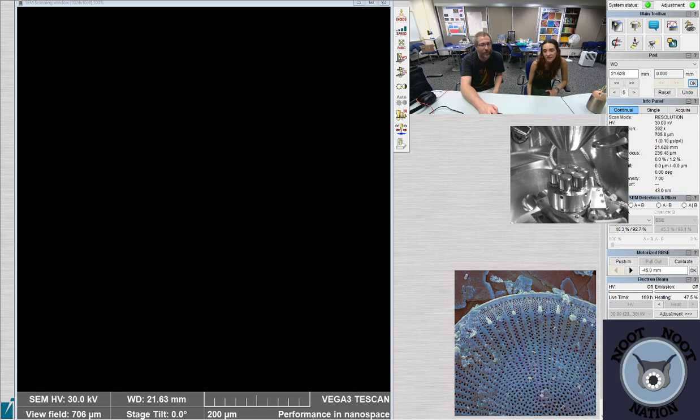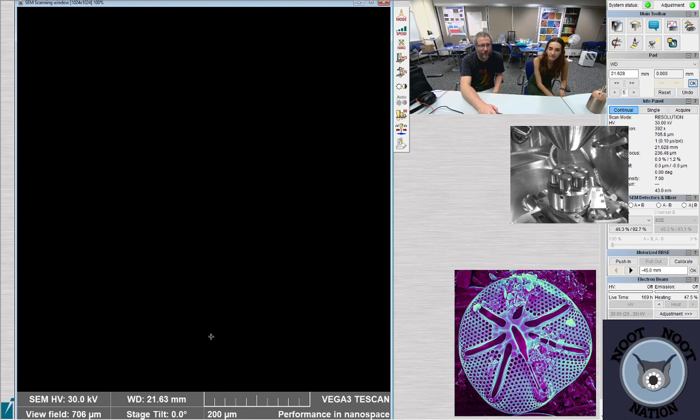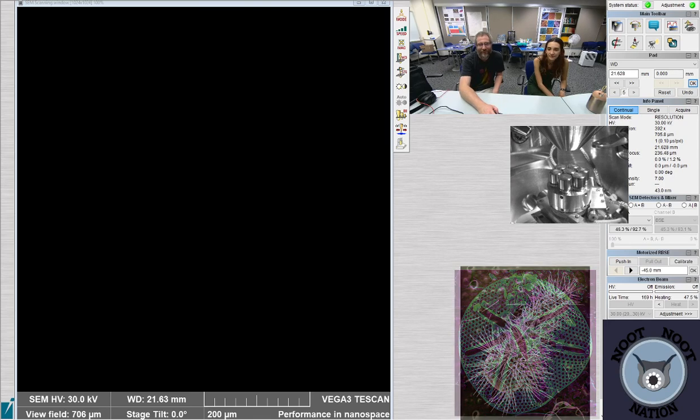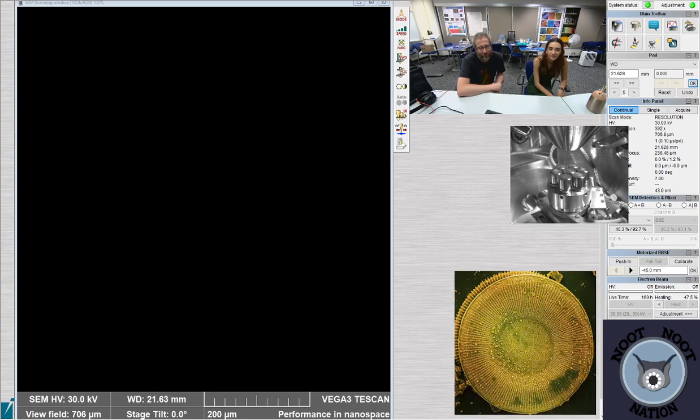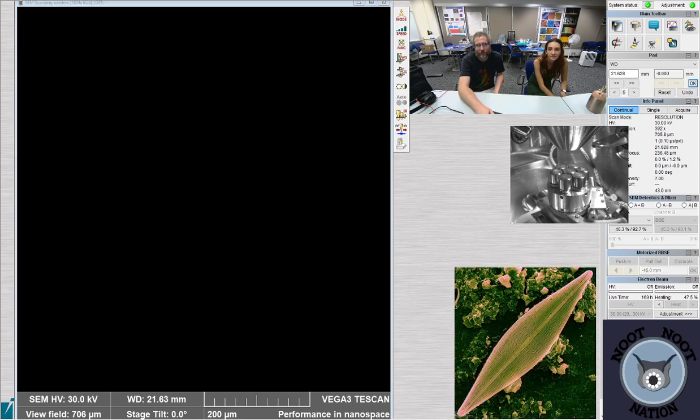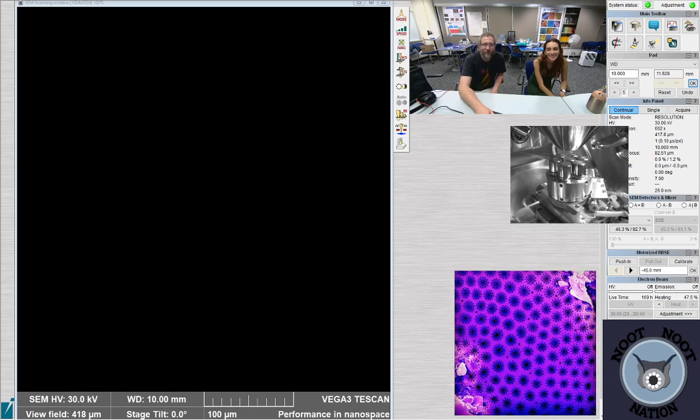So, right now we're just waiting for the chamber to pump down, and it's gradually doing that. Just like the sputter coater. You're a helper. I'm a helper. Just like the sputter coater, we're fighting the humidity a little bit, so we just have to wait for the moisture-laden air to pump out. And then we'll be able to look at it. Not the air, but the diatoms. In the meantime, we can scooch it up. I can do the part that makes everybody nervous. I can do most of it. I'm going to move us up to 5, but I'm going to wait until we actually have something in there. Yeah. Until it turns green for us.